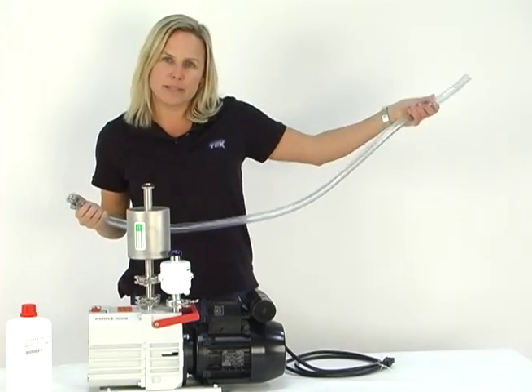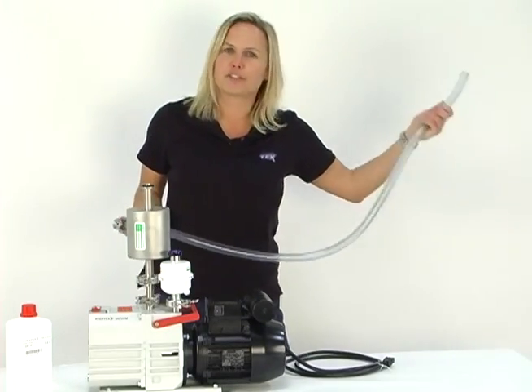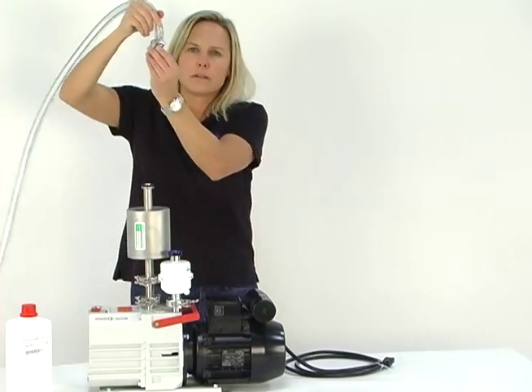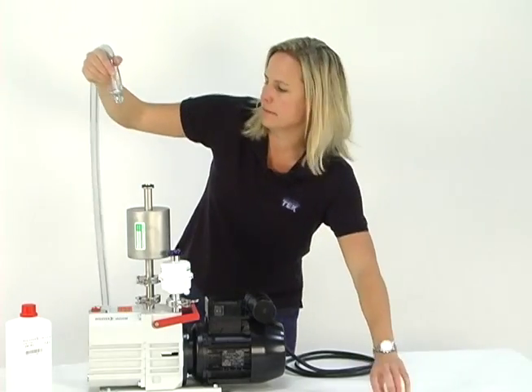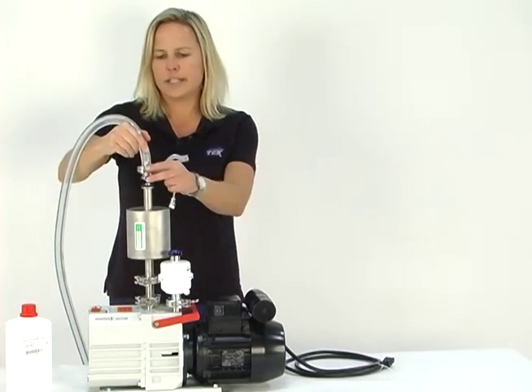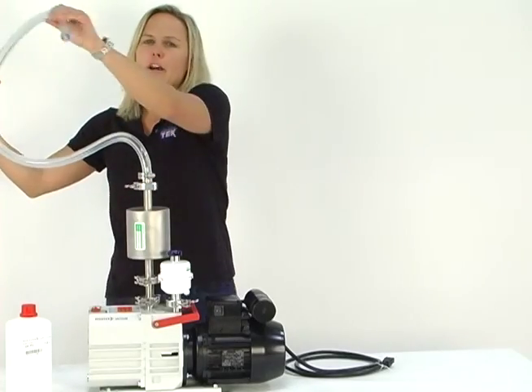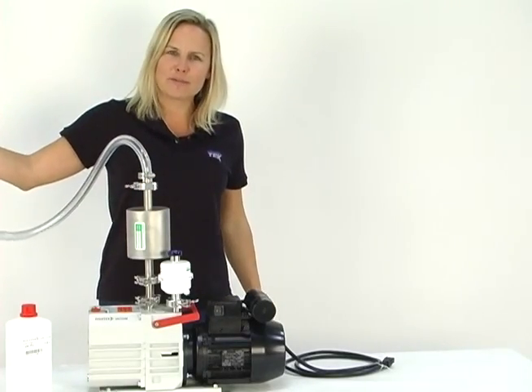Leave the other end empty — this will be connected to the vacuum oven, and I'll show you how to do that next. Take this end with the flanged fitting, seat it on top of the four-line trap, and we are ready to go. We are ready to connect this end to our TVO2 vacuum oven.